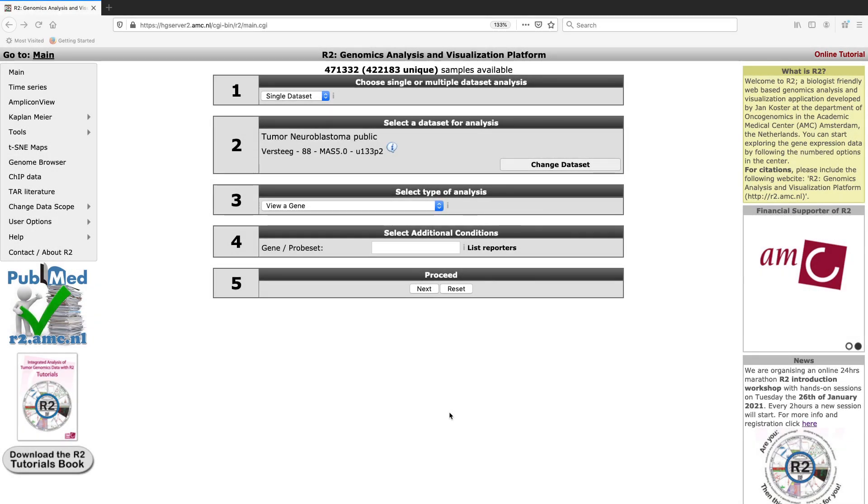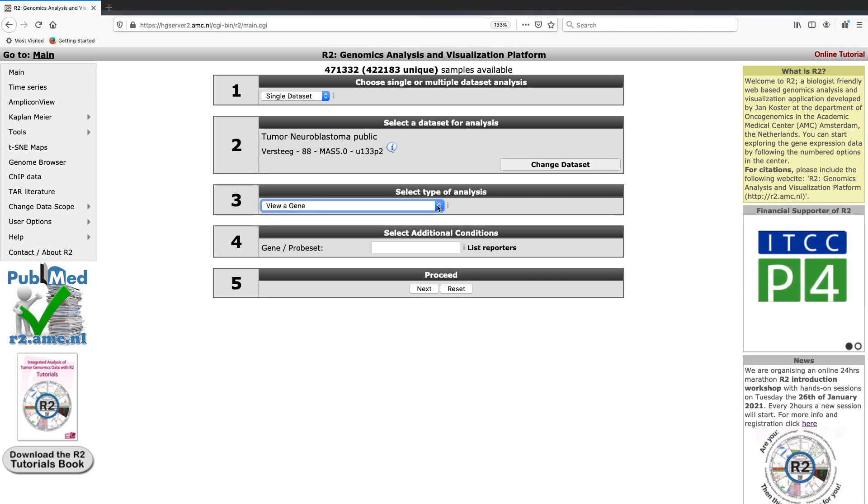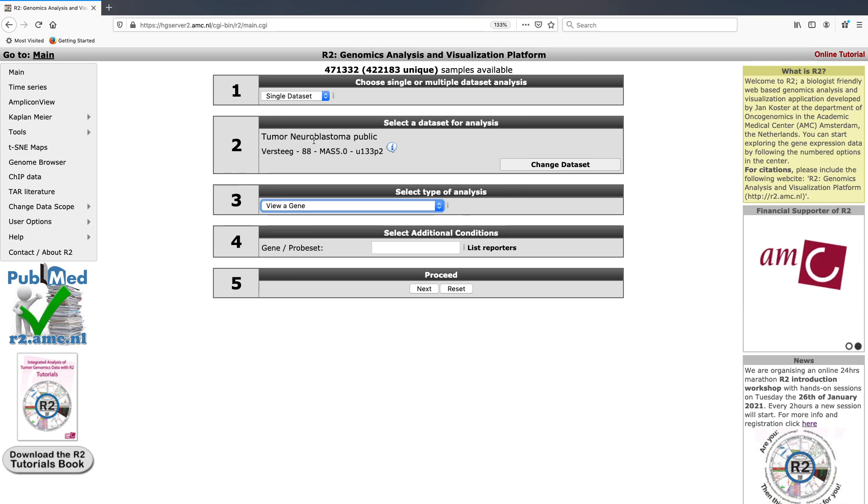In this module, we're going to be looking at how to view multiple genes at once. We're going to be using the tumor neuroblastoma dataset consisting of 88 tumors and run on the U133P2 Affymetrix platform.